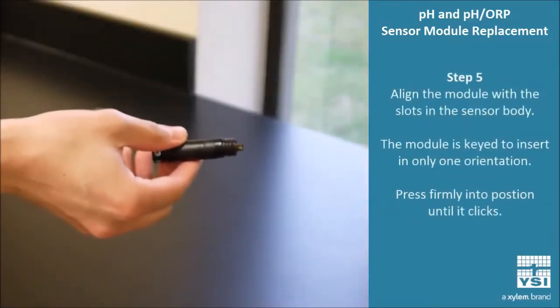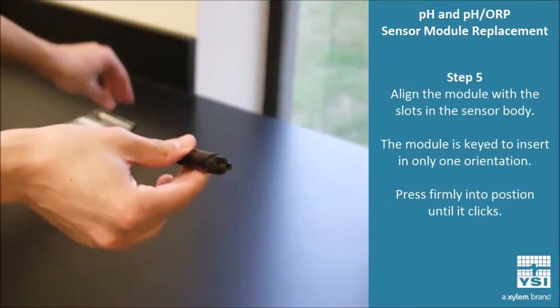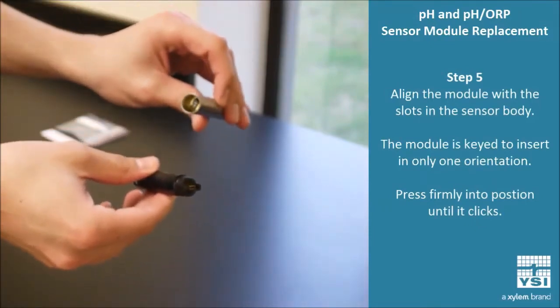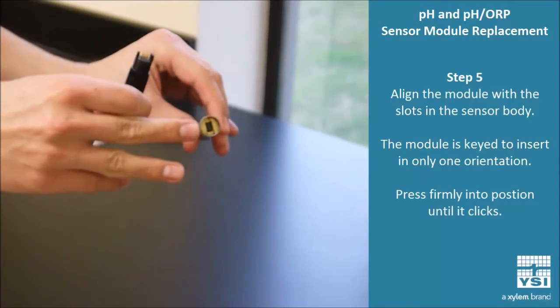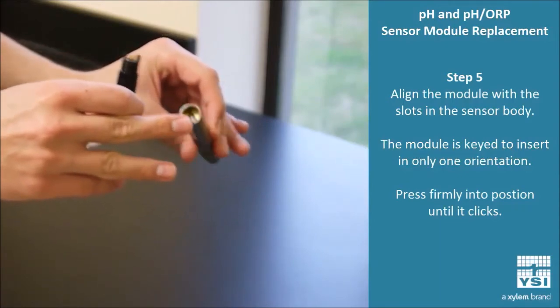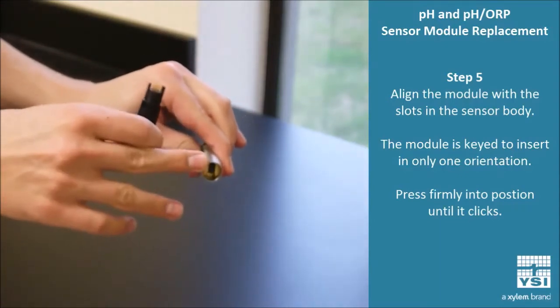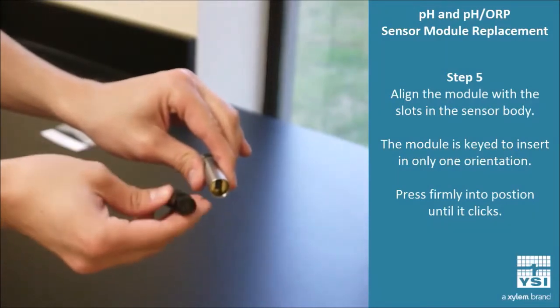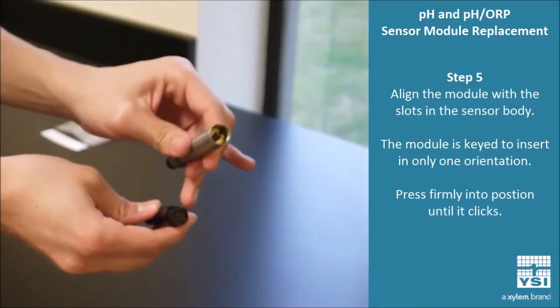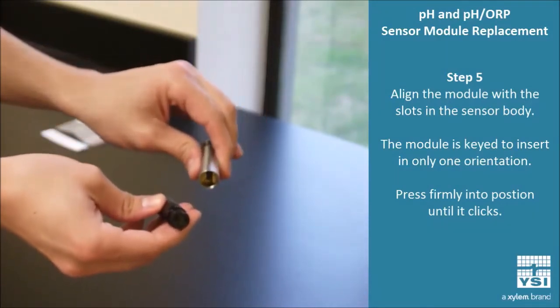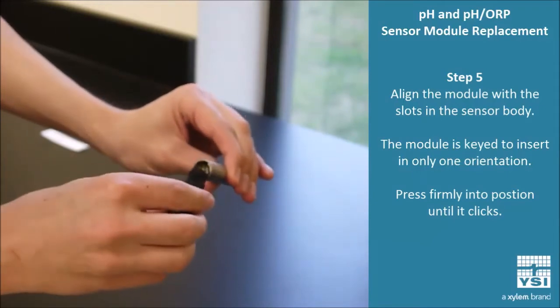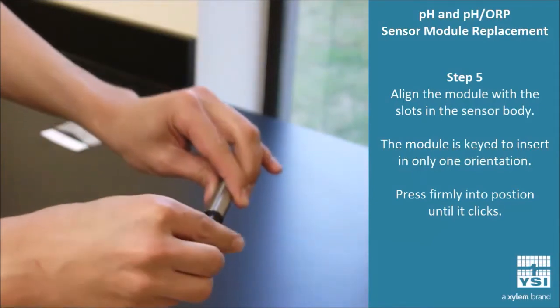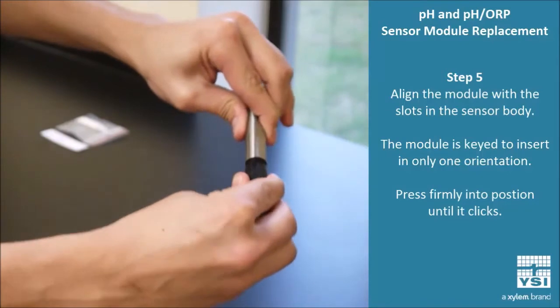Step five is now to install the new sensor module into the probe base. Inside the cavity here, you can see that there are plenty of slots. There's a larger opening and a smaller opening. You want to make sure that those line up with the pins that are on the bottom of the module. Once you have those lined up to the best of your ability, you can plug it in about halfway.